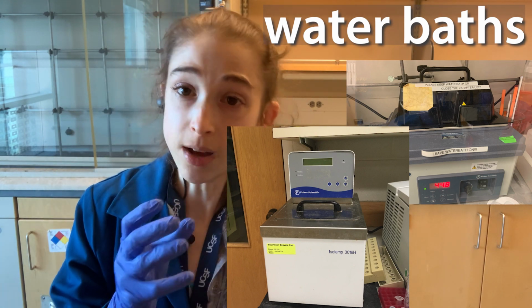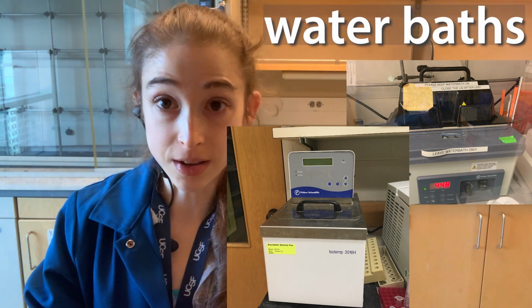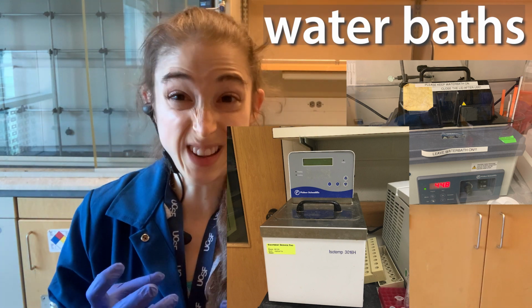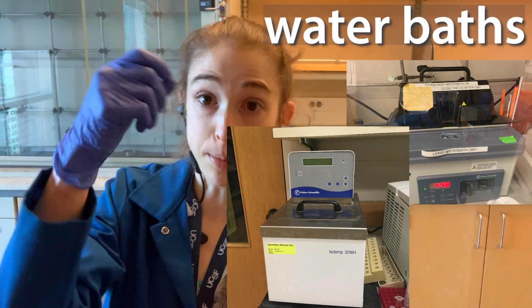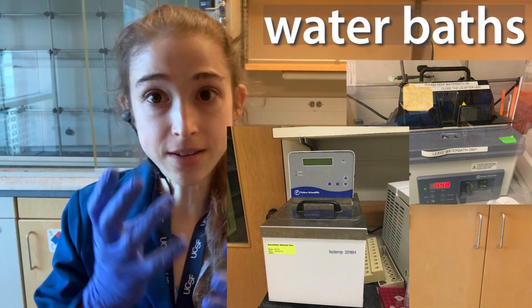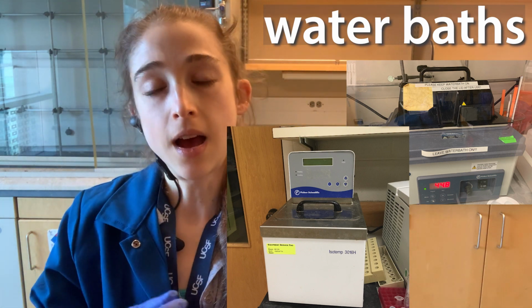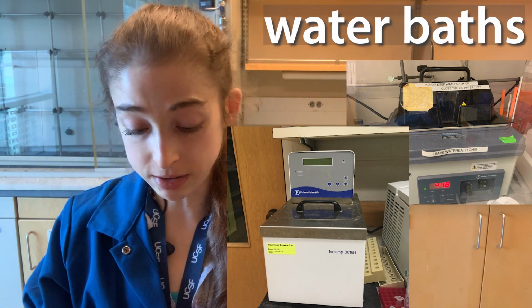These are really helpful if your tubes are big, bigger than can fit in one of those thermal shakers. If your samples are irregularly sized, maybe you want to stick a bottle of media, so bacteria or cell food, in there, and you have these big bottles, well, that's not going to fit in one of those thermal blocks. And so these water baths are really great for this.